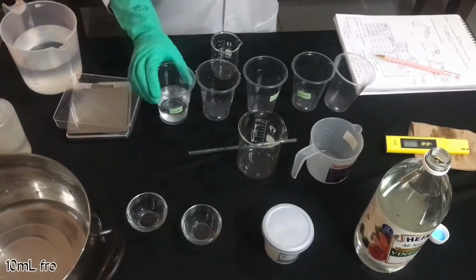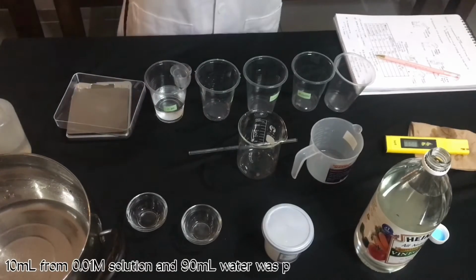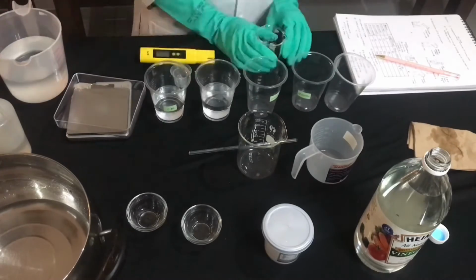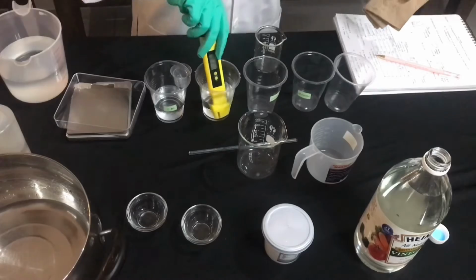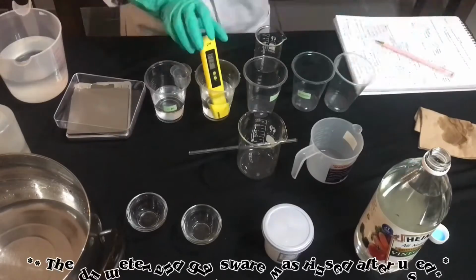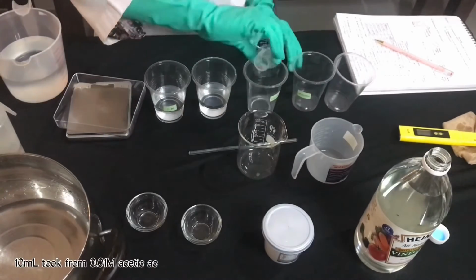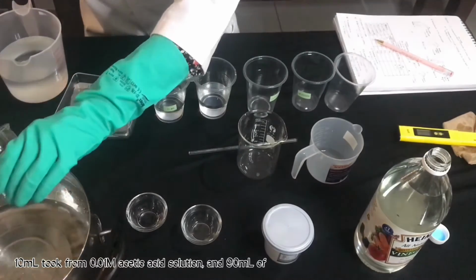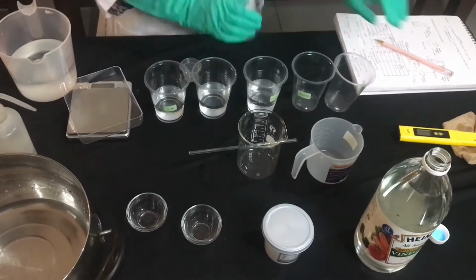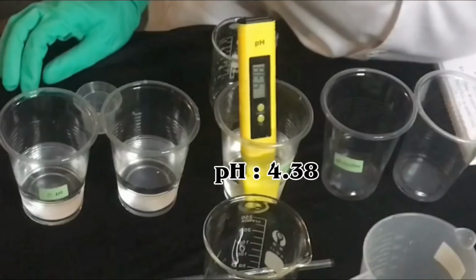From the 0.1 molar acetic acid solution, a 0.01 molar solution was prepared with a volume of 100 ml. The pH was measured and I get 3.73. From the prepared 0.01 molar white vinegar solution, 0.001 molar acetic acid was prepared. The pH value I get is 4.38.